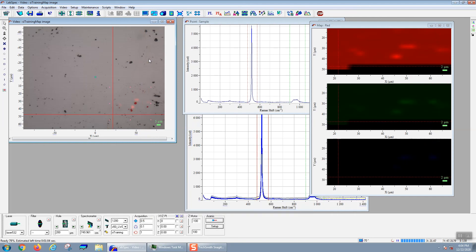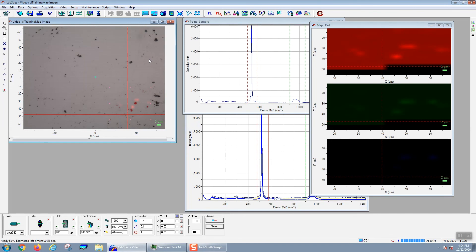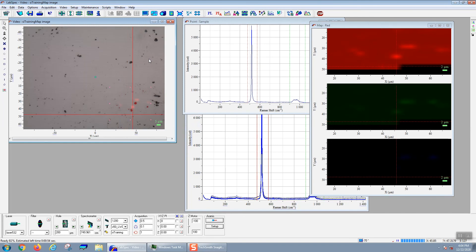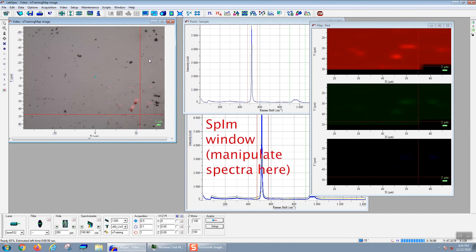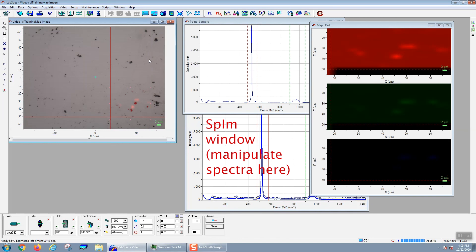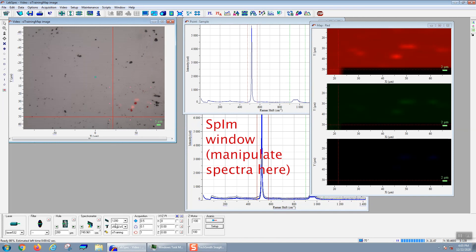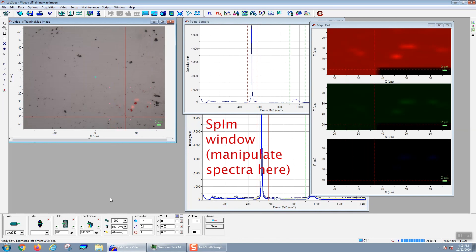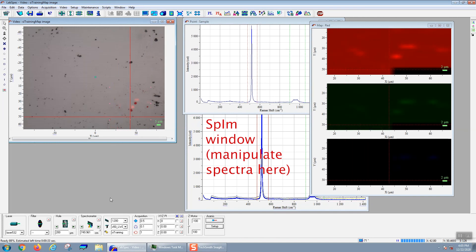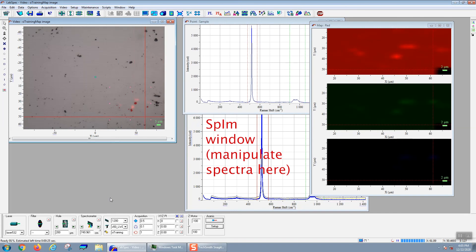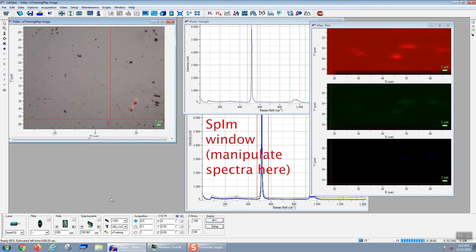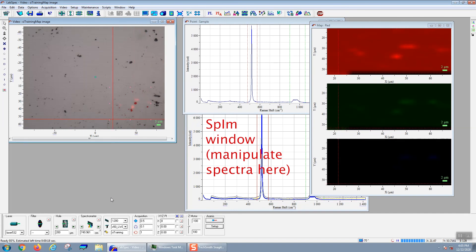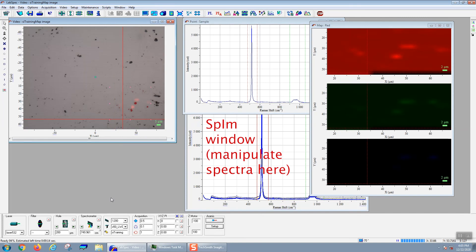When the Raman microscope is done, then your map will be complete. Again, this SPIM window is the most important window. For example, if you want to do any sort of processing or saving, you would operate on this window. All of the maps can be regenerated from the SPIM, but you cannot regenerate the SPIM from the colored maps.